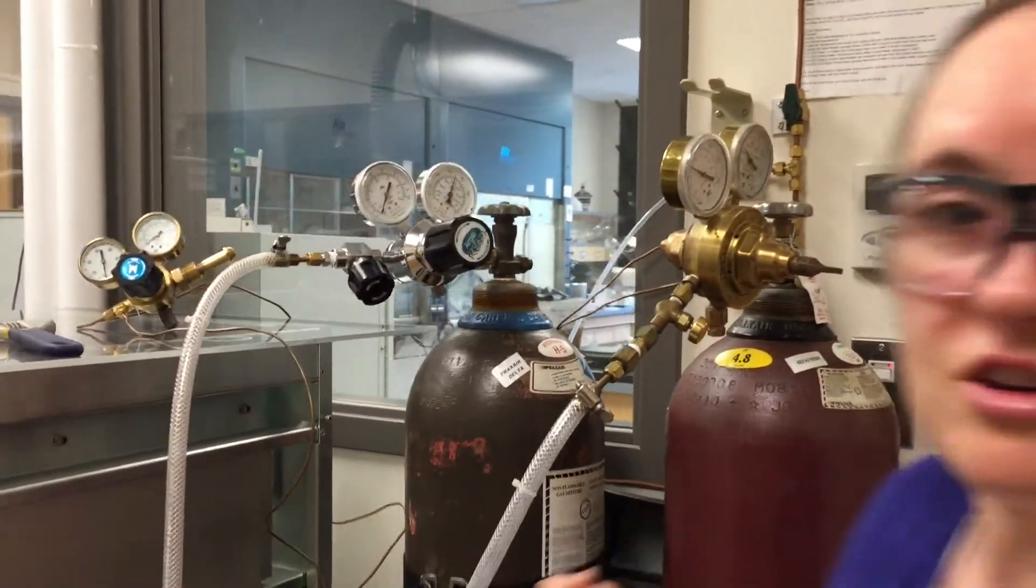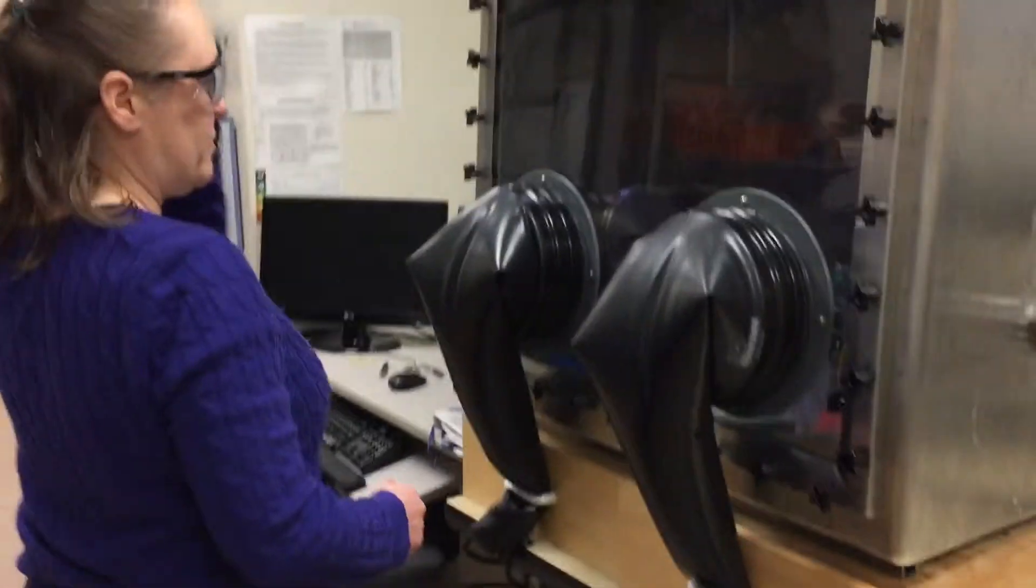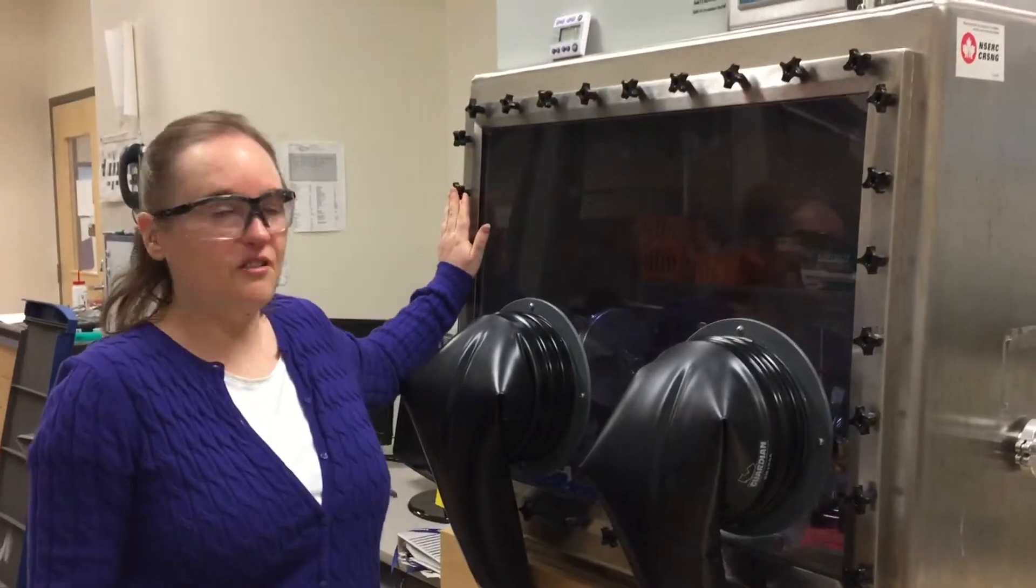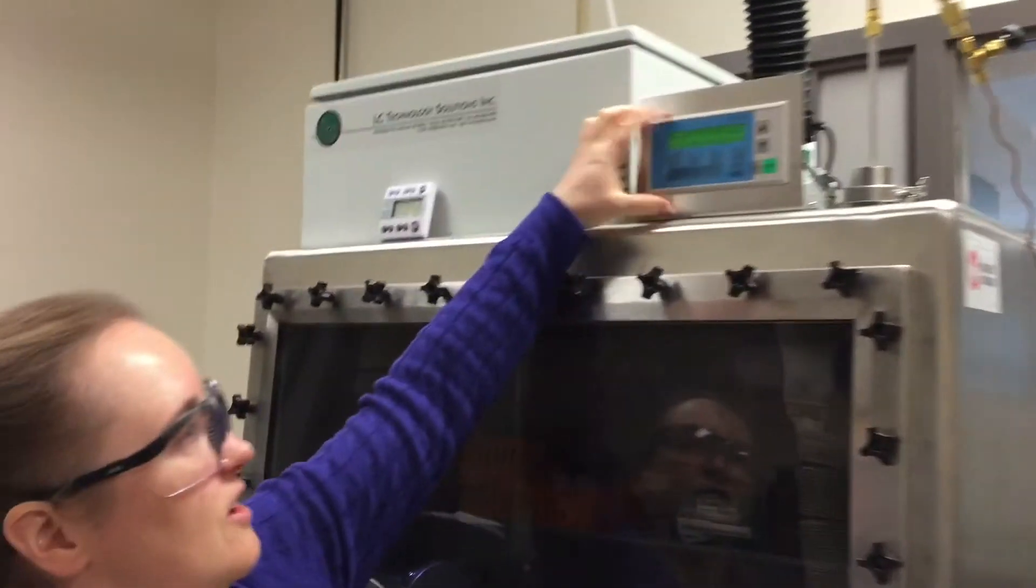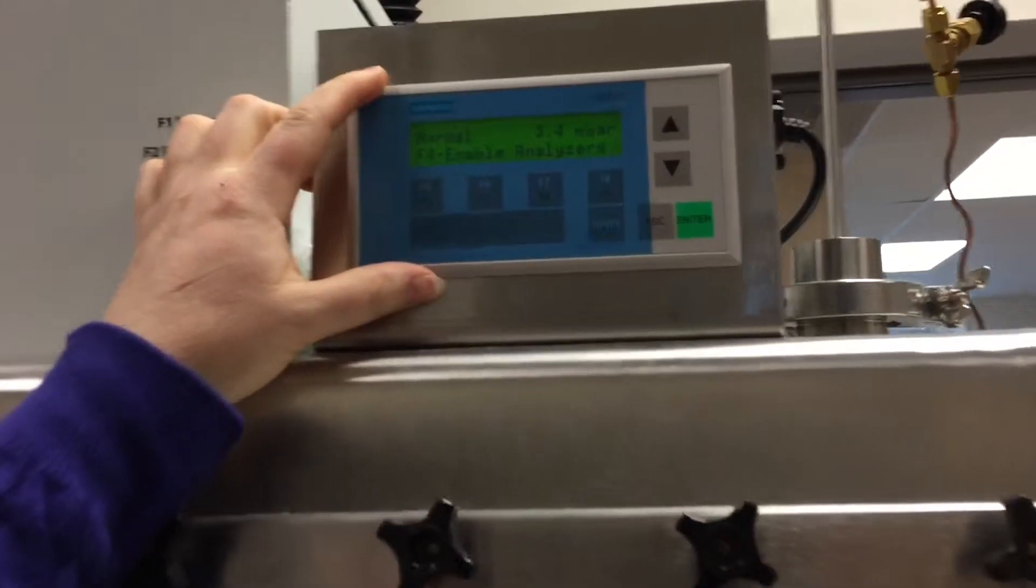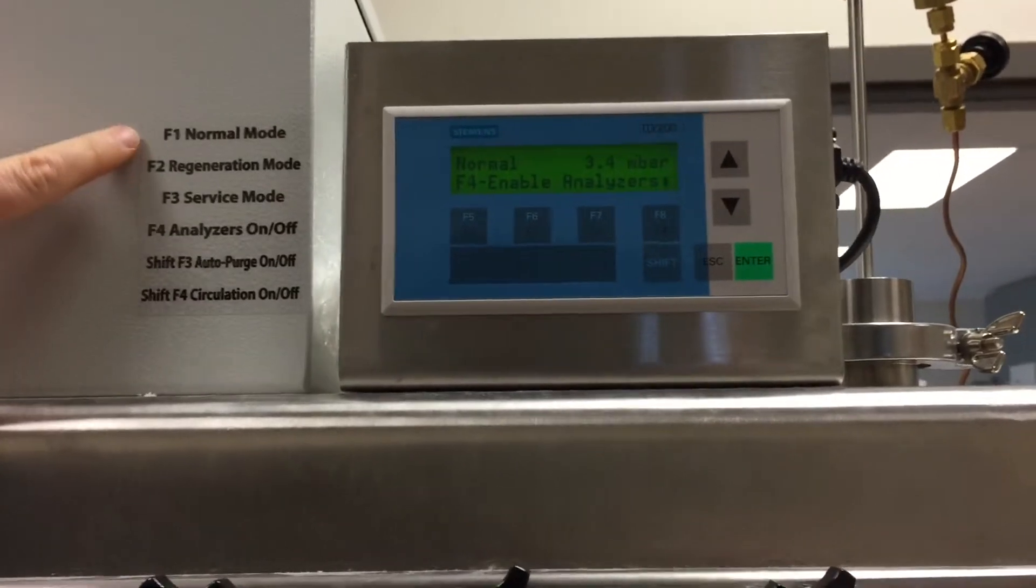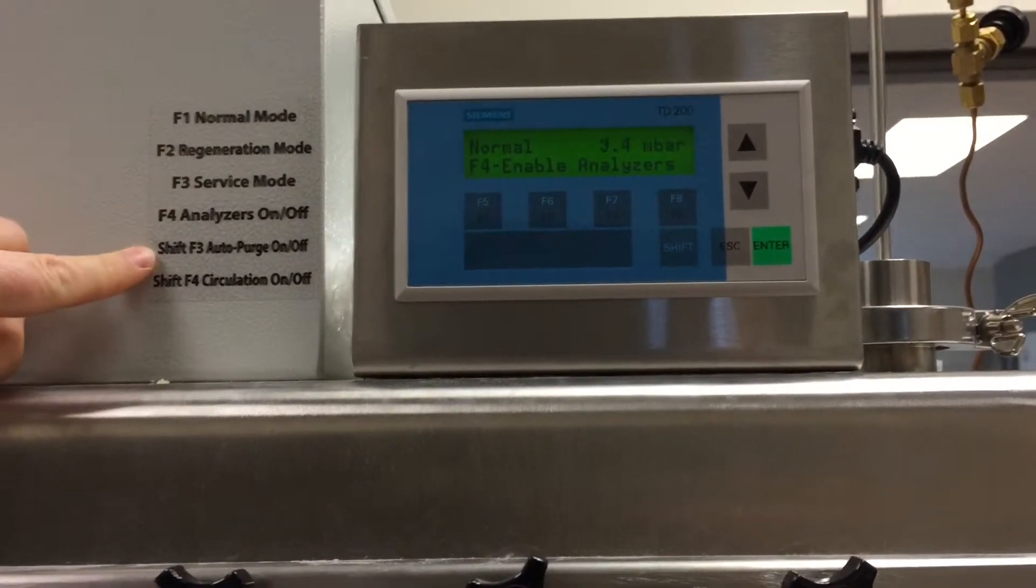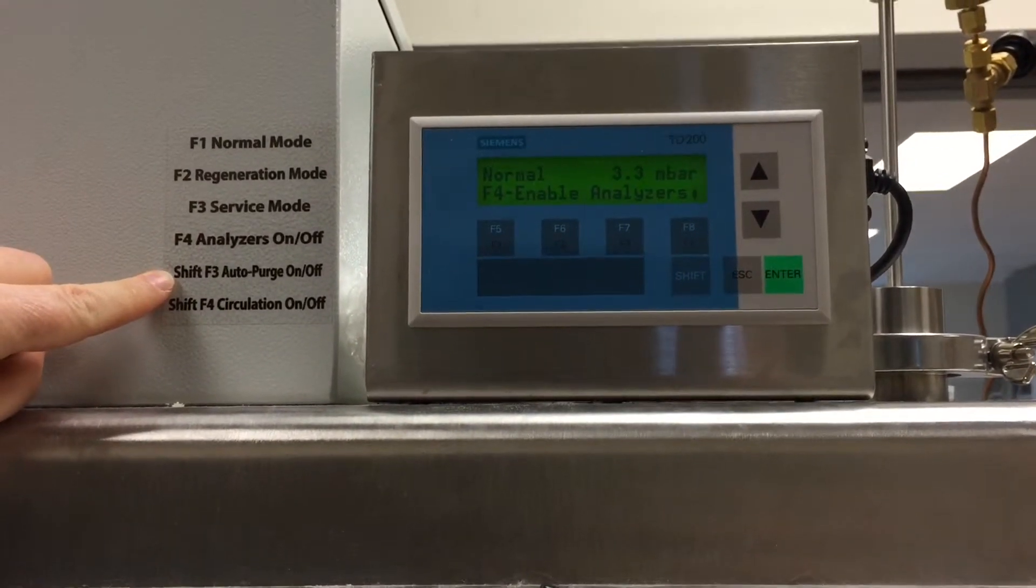So now we can go over to the glove box and we can turn on the correct settings that we need. This is our small glove box. There's an operating panel up here on the top. So there's a little sticker code that tells you what you have to push in order to get everything ready.